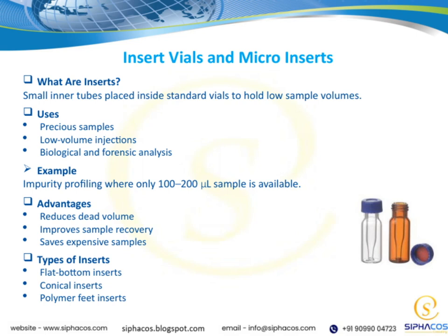They are small inner tubes that you place inside standard vials to hold low sample volumes. This design helps us manage very small amounts of samples more effectively. In terms of uses, inserts are especially valuable when working with precious samples or when performing low-volume injections. They're also widely used in biological and forensic analyses, where sample conservation is critical.